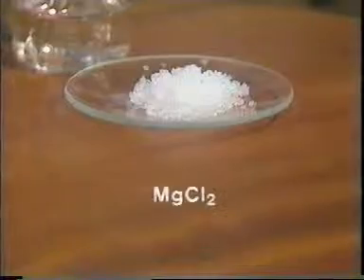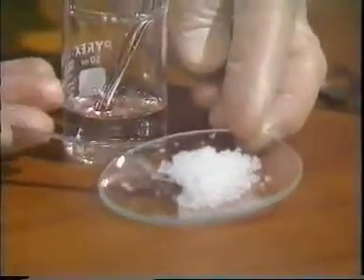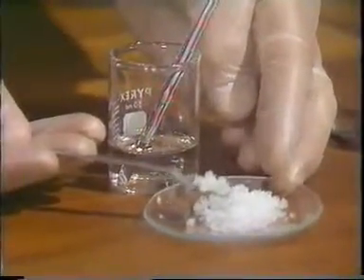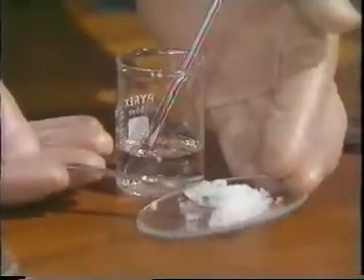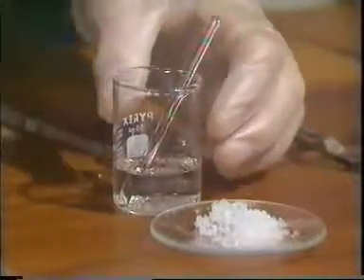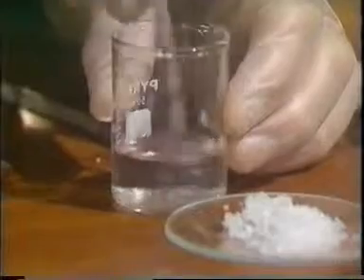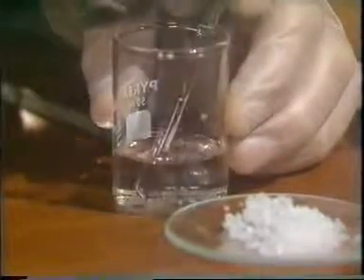Now, magnesium chloride. This too is a white solid. We've got the hydrated material here because the anhydrous magnesium chloride is not easy to come by in a pure state. And if I stir this, there doesn't seem to be any sign of a reaction, and again it's dissolving quietly.